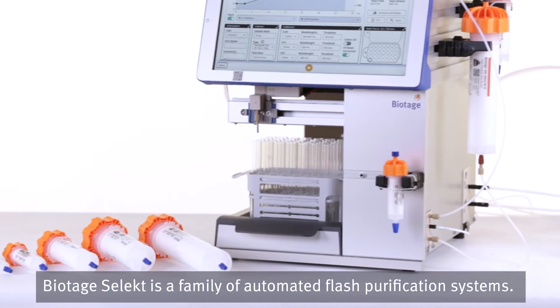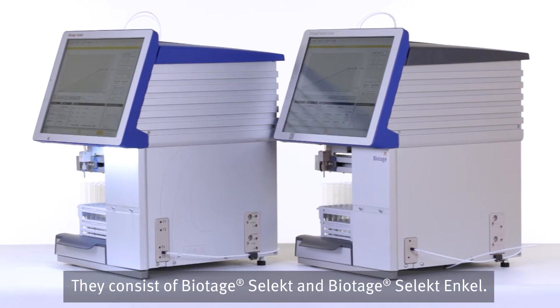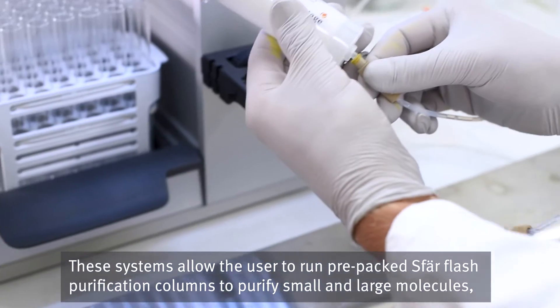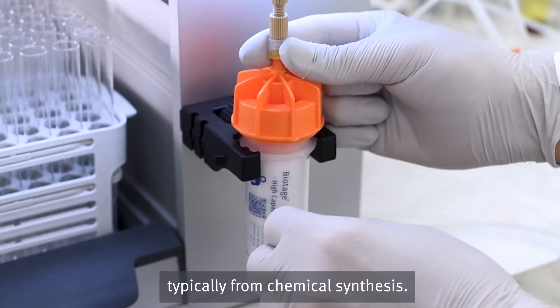Biotage Selekt is a family of automated flash purification systems. They consist of Biotage Selekt and Biotage Selekt Enkel. These systems allow the user to run pre-packed SFÄR flash purification columns to purify small and large molecules, typically from chemical synthesis.